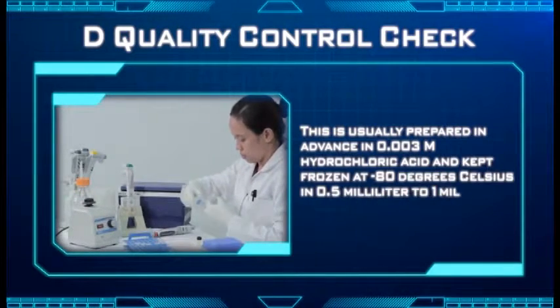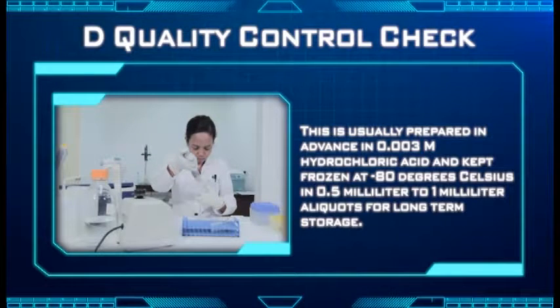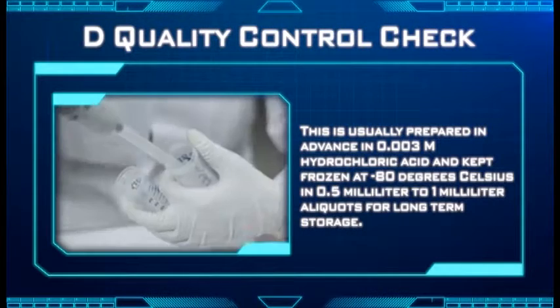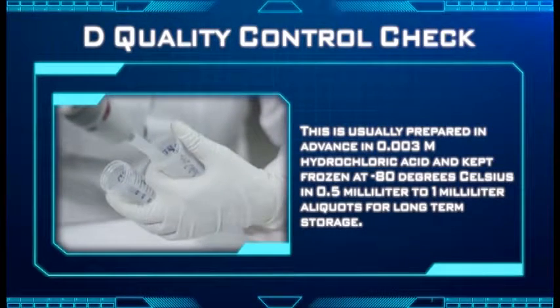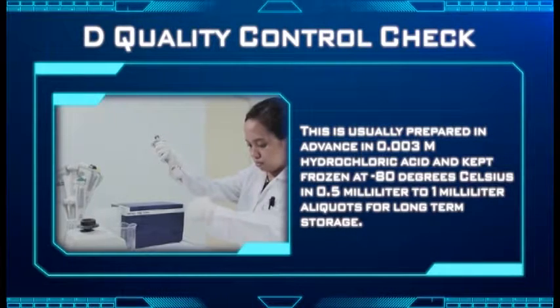This is usually prepared in advance in 0.003 molar hydrochloric acid and kept frozen at negative 80 degrees Celsius in 0.5 milliliter to 1 milliliter aliquots for long-term storage.